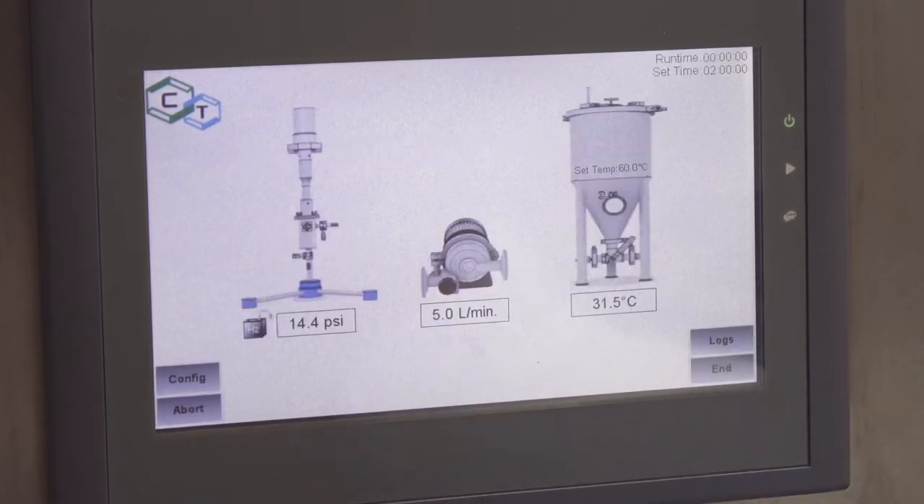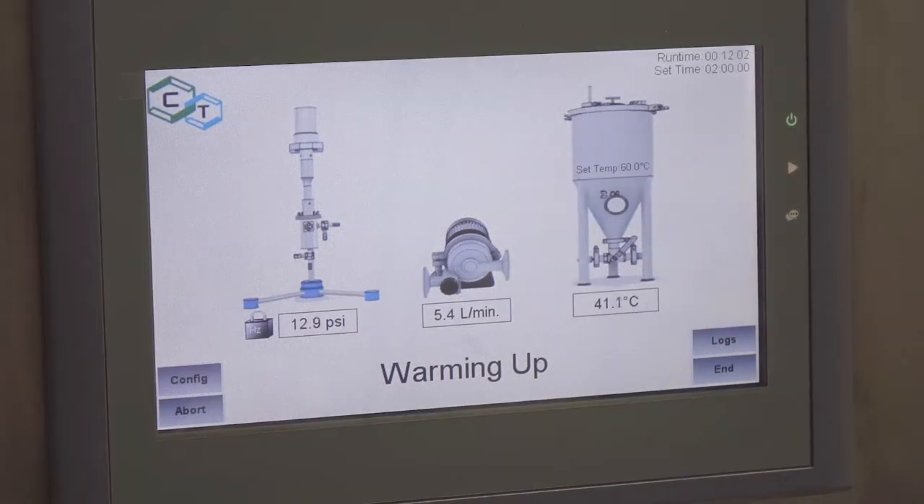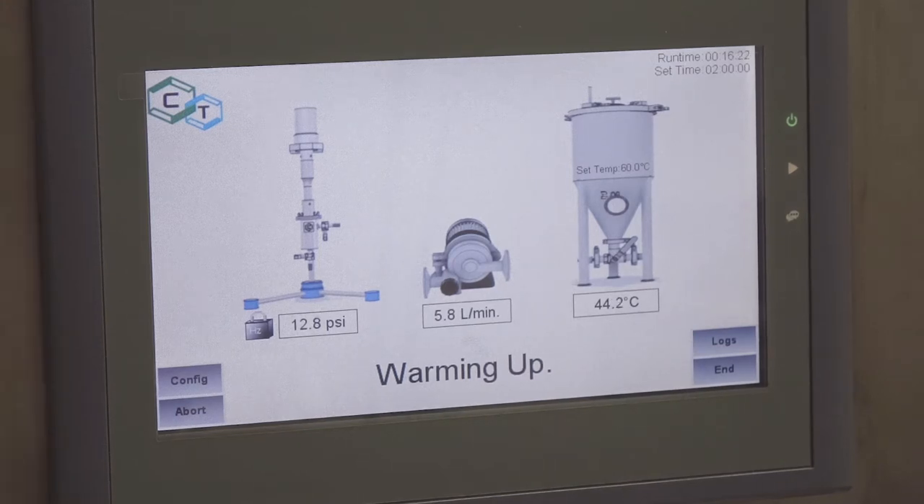Hit start, and the IAS2100 Automation Controller actuates the ultrasonics, turns off the cooling for the warmup cycle, and begins monitoring the process parameters. In the case of a deviation or critical failure, the system will shut down into a fail-safe mode and sound an alarm.